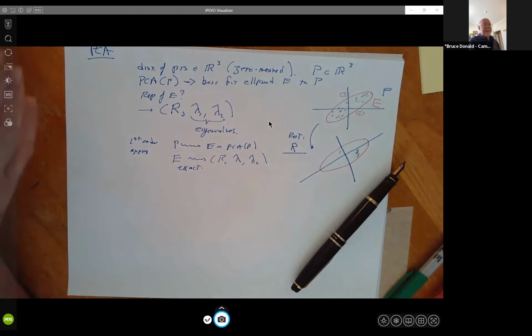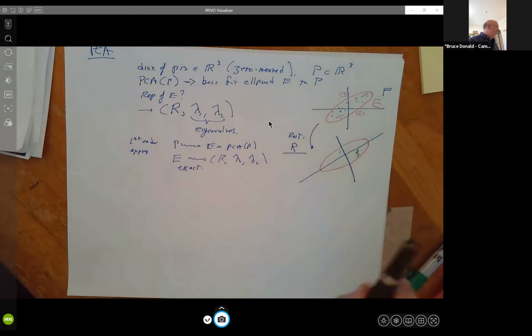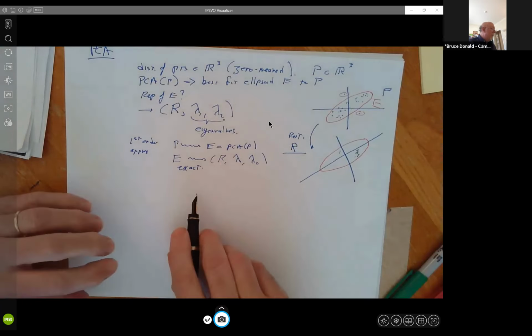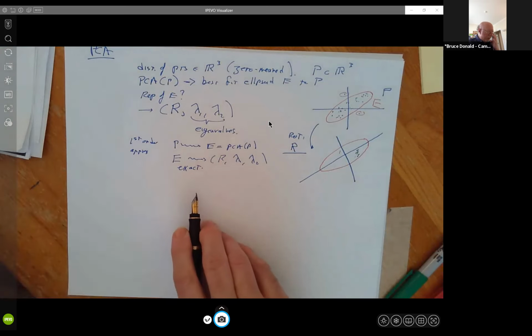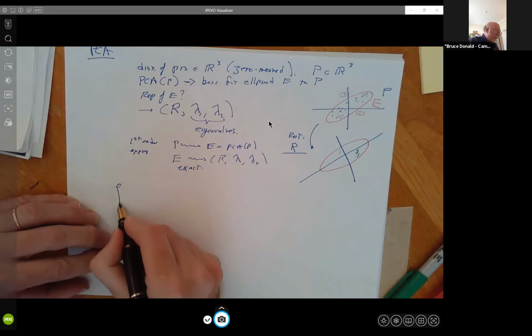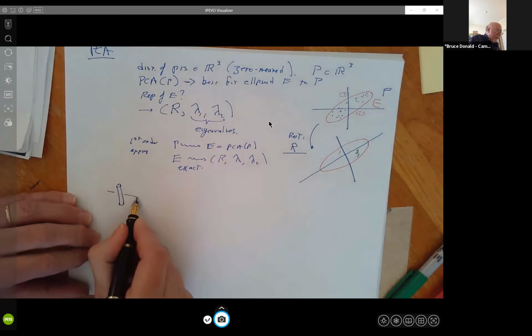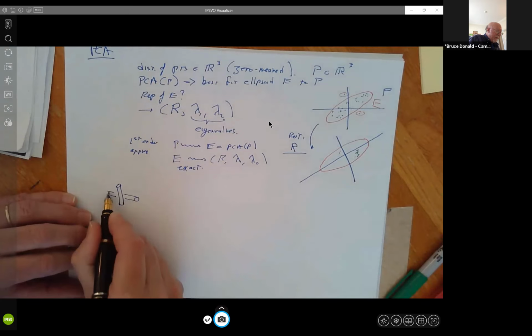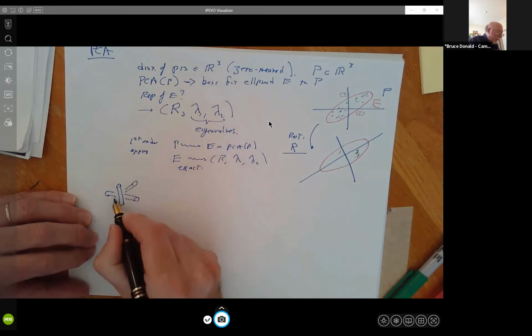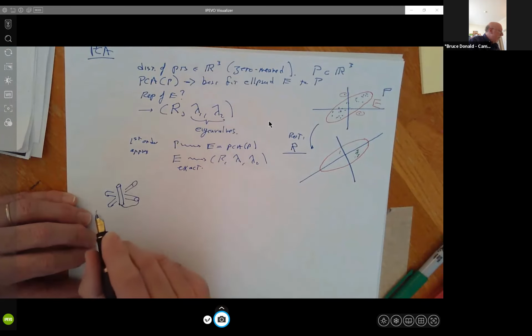Now let's apply it to something kind of molecular. So suppose we have a molecule that's approximately aligned to B0, right? Because we used an aligning medium. So let me draw something a little bit more interesting than what we had before here. I've got some helices here. I'll draw them like this. And how about one in the back? Okay. And let's hook these up in some fashion like that. And hook them up like that, right? We have something coming like that.